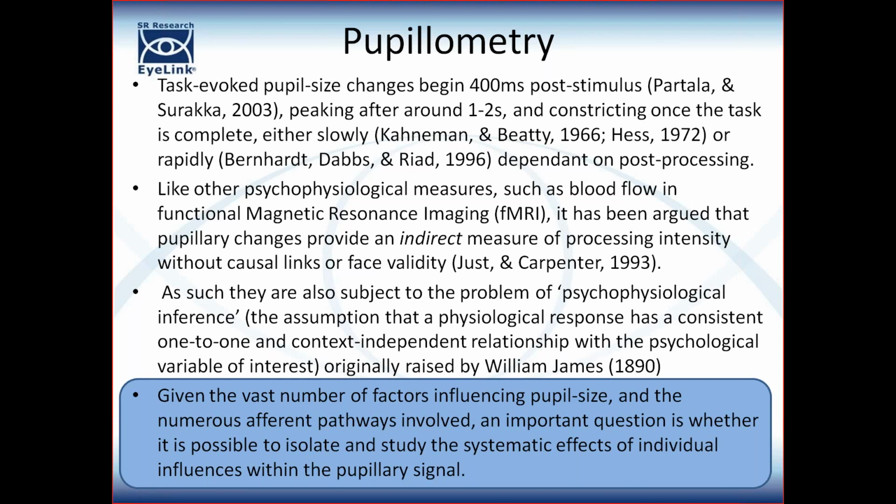It also has implications, I think, for things like reading research. It might be nice to think that, you know, we could use pupil size to see how difficult it is to read certain words, but you have to bear in mind the fact that we don't spend very long fixating individual words, and it may well be that the response you're looking for is going to happen after gaze has moved on to other words, for example.